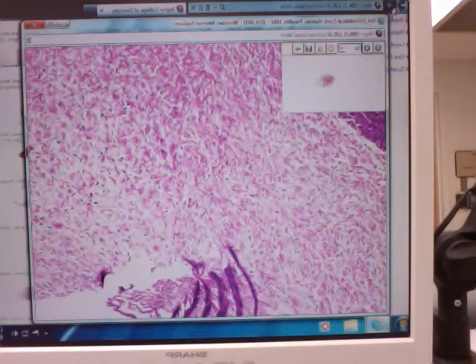I think there are some artificial spaces there, Colin, that you see, and it's not a true lacunae. The thing about it, too, when you see the chondrocytes, they're typically not going to have that big of a nucleus. It's typically more rounded in shape. That's why you don't focus on one spot. You look all around and get a feel for everything that's there.